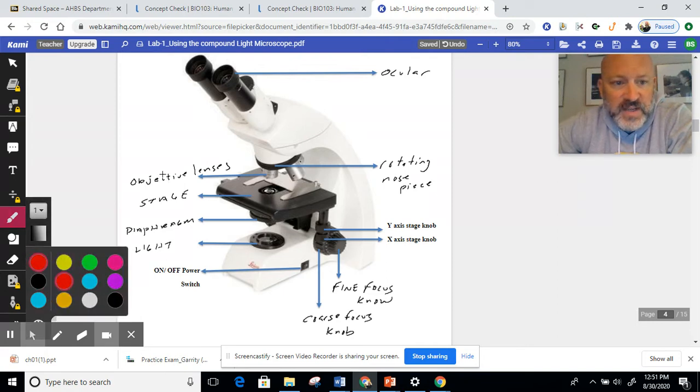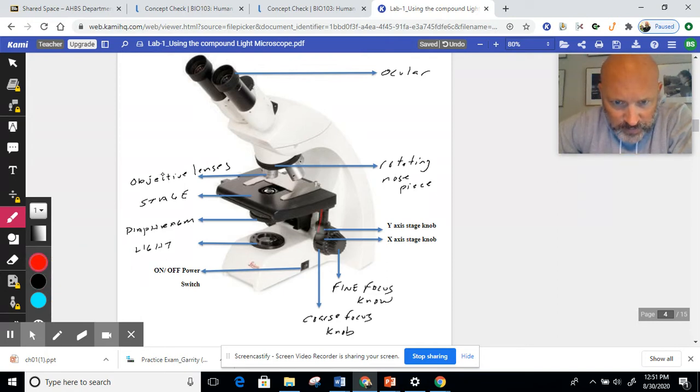They're on the same device, right? So there's this little stem that comes down, and then the stem has 2 knobs on it, one here and then one here. All right.